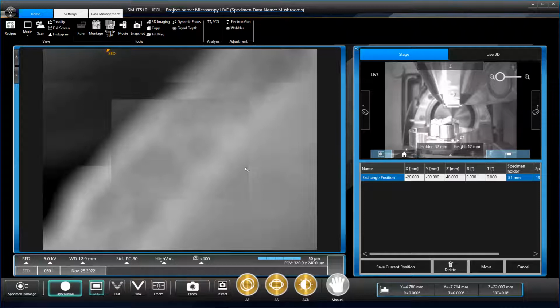But they're totally different in texture. So it'd be cool to potentially look at them one day as well. Yeah. I'll just whack it in coarse and really go for it. There we go.